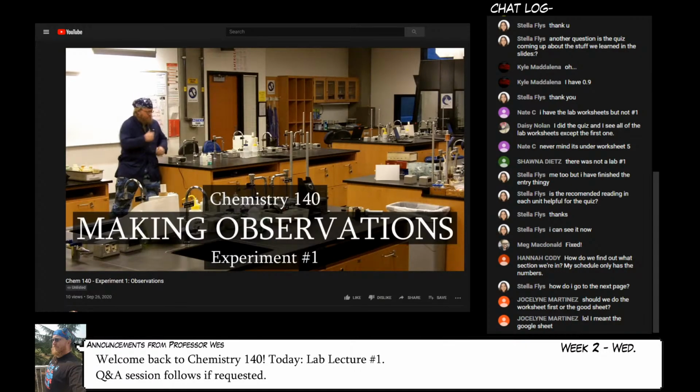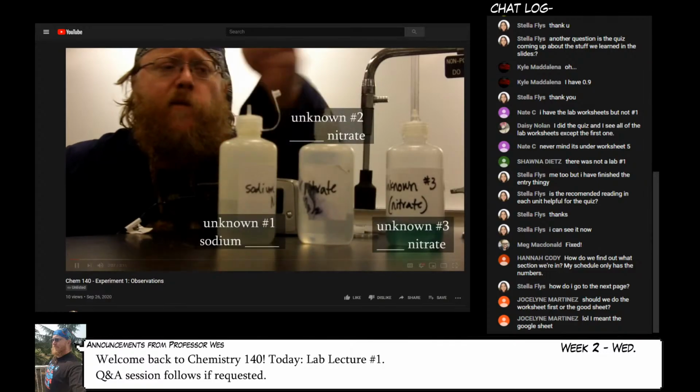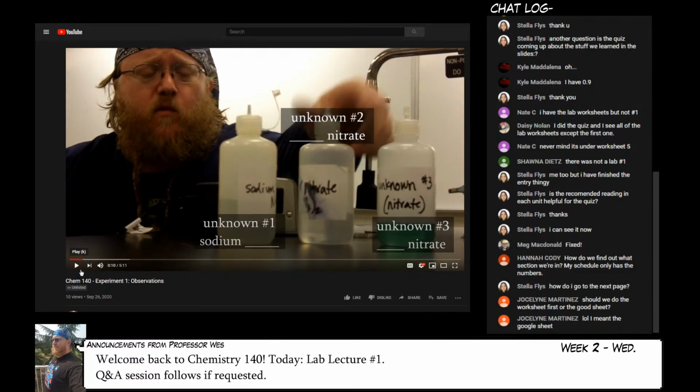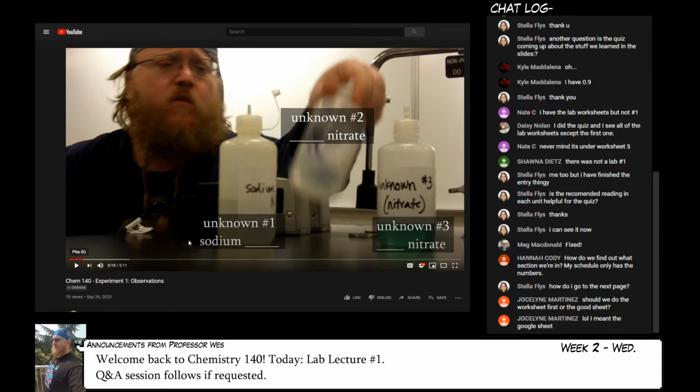And I even wrote the music. I'm not going to play it in its entirety, but the point is, here's some unknowns. That's a really terrible shot for me to pause on. Let me just open my eyes here. Here's some unknowns. We're going to identify them by mixing them with known chemicals, okay?